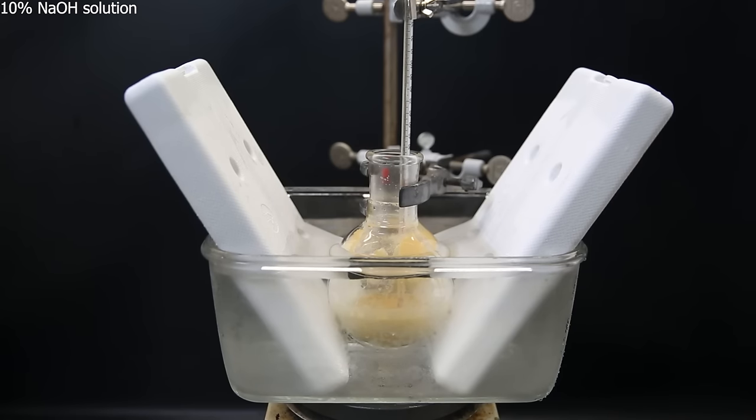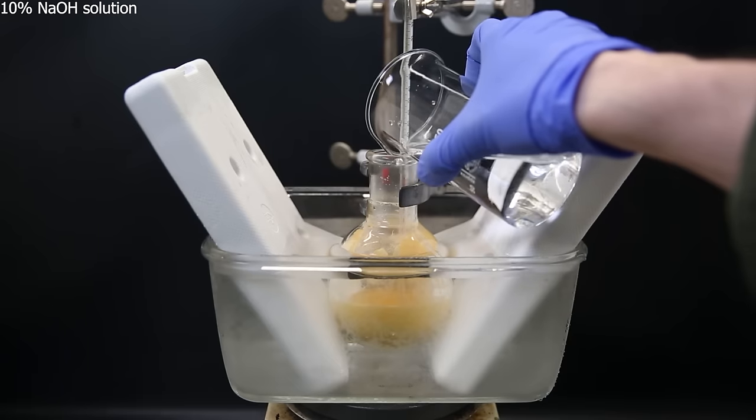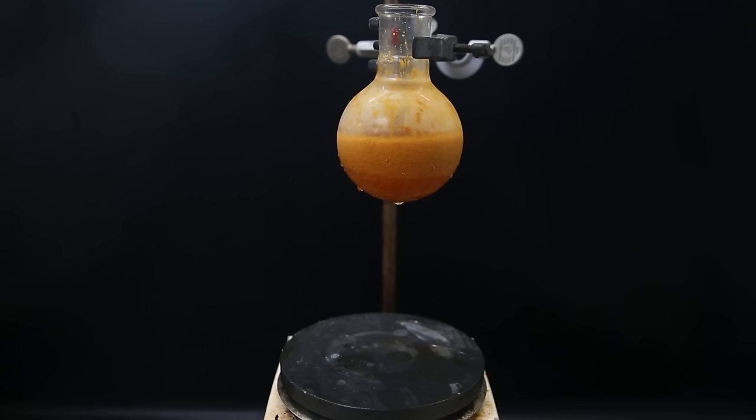I keep adding the solution until the mixture in the flask is slightly basic, which is the point where I know all of the hydrazine hydrochloride has reacted to form the free hydrazine. When the addition was complete, the mixture had turned more orange, and the pH strip told me the solution was slightly basic. I then left it to stir for 1 hour in the ice bath, to ensure full conversion.